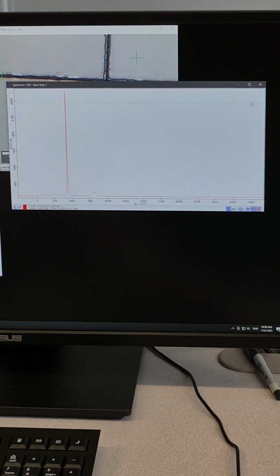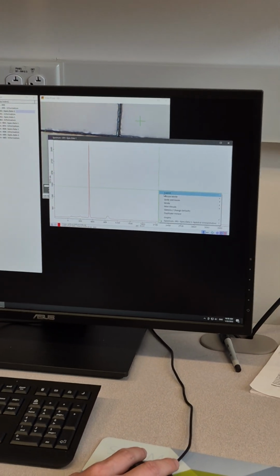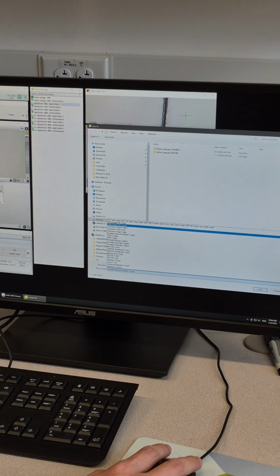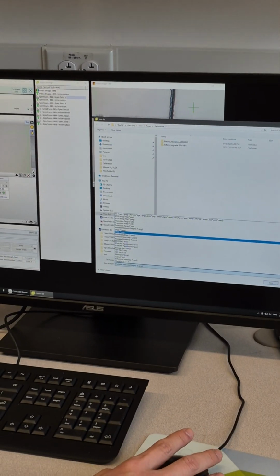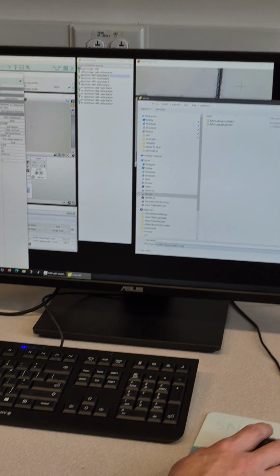It will save this spectrum into an image file. The format of the image is some standard one, so you can choose yourself: PNG, TIFF, JPEG, some popular ones and some not popular ones.